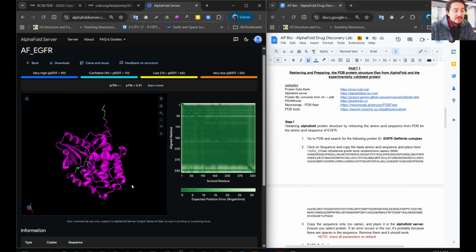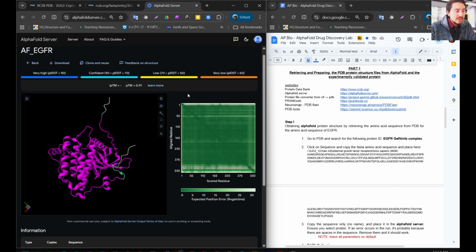They do get more specific depending on the different types of protein, where you can see very specific squares along this matrix. But for now, that's all you really need to know. If you would like to take a screenshot of that, that's fine.